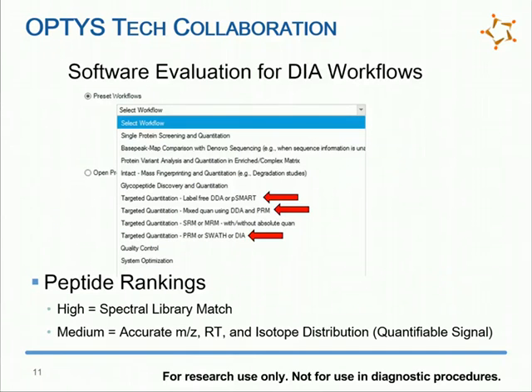We've been collaborating a lot, both with Thermo, with Scott Peterman, and also with Optys Tech, with Amol Prakash. We've been doing software evaluation for the DIA workflows and for the mixture of DIA and targeted MS2.